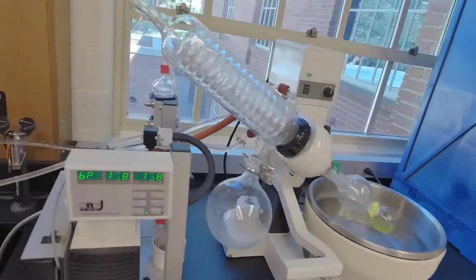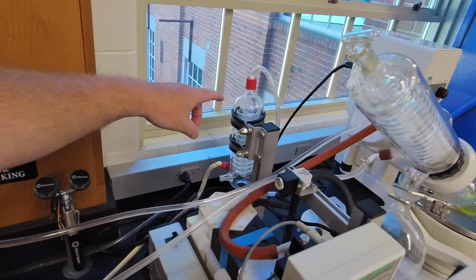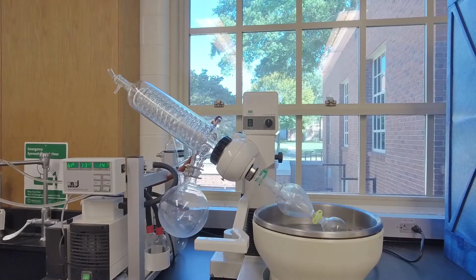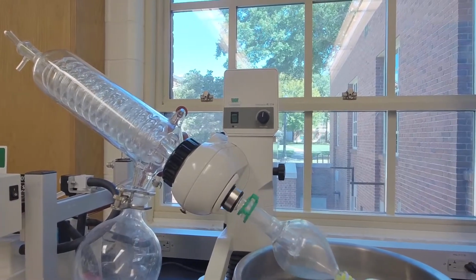And so back here in the back, we have a second condenser. That second condenser is to just trap whatever gets past the first condenser, again, to keep the solvent out of your pump.